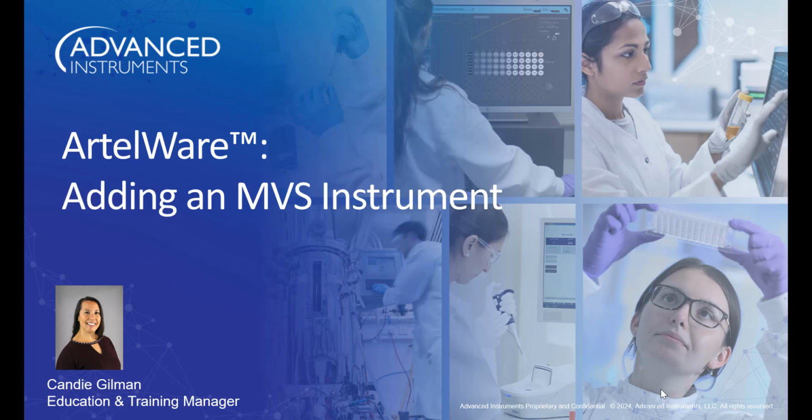Thank you for joining me for this brief tutorial that walks through the steps of adding an MVS instrument to the ArtelWare application. Let's go ahead and get started.